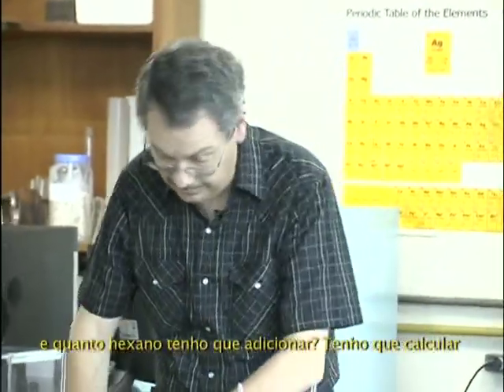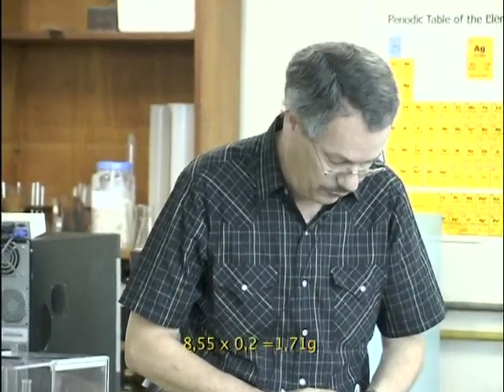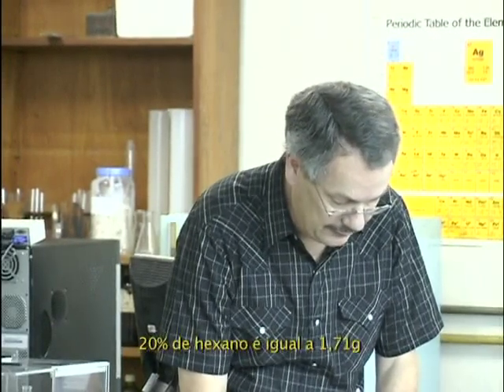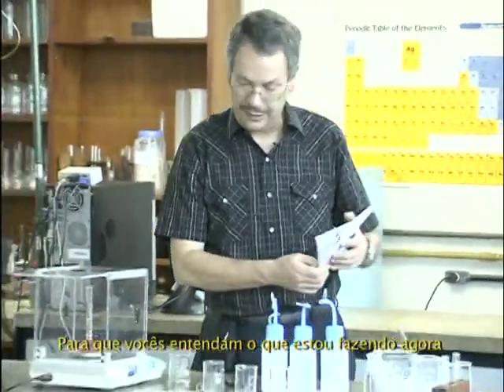And how much hexane should I put in? I have to calculate. I have to put 8.55 times 0.2 is 1.71. Just two numbers? Yes. 20% hexane is 1.71 gram.